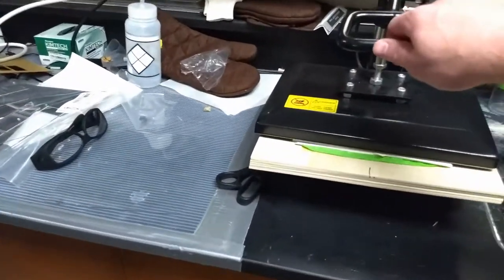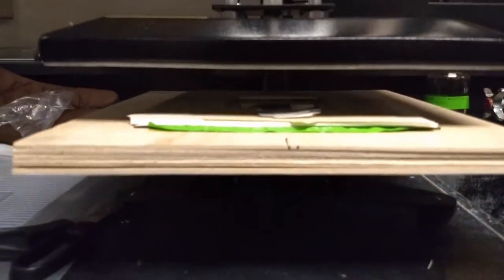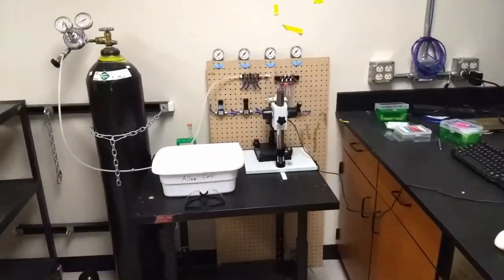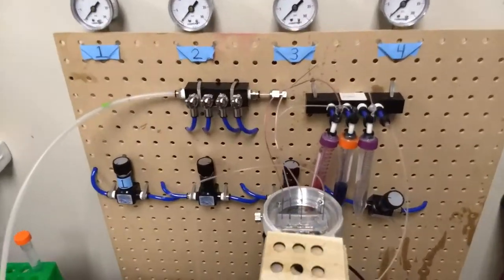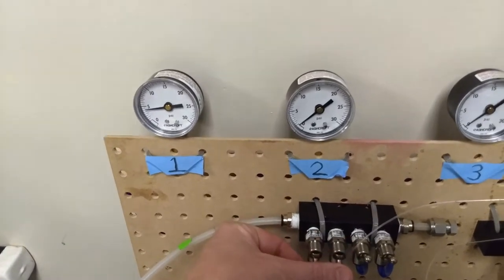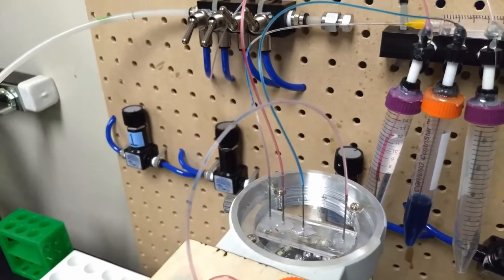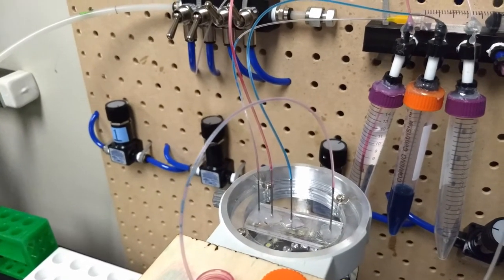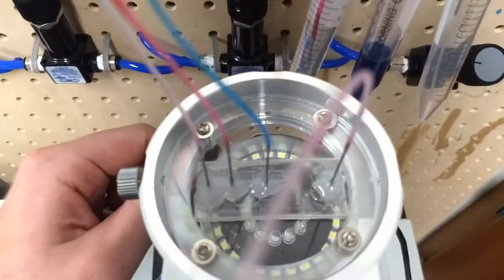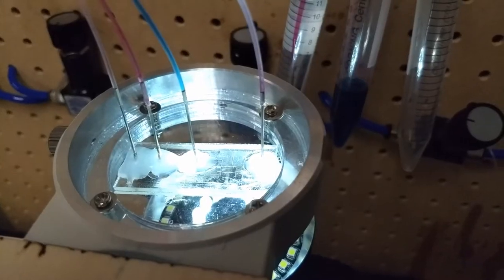Once the design is done, I take it over to this heated press, put it in a little jig with some spacers, and press it at about 150 degrees C for 10 to 15 minutes with an acrylic cover. Then it's ready to go on a microscope. You can see that same design all printed up and ready to go. I use a gas tank to pressurize it and drive red and blue fluid through the chip. I'll turn on the little light on the microscope — when the red oil and blue water mix, they make tiny little droplets.